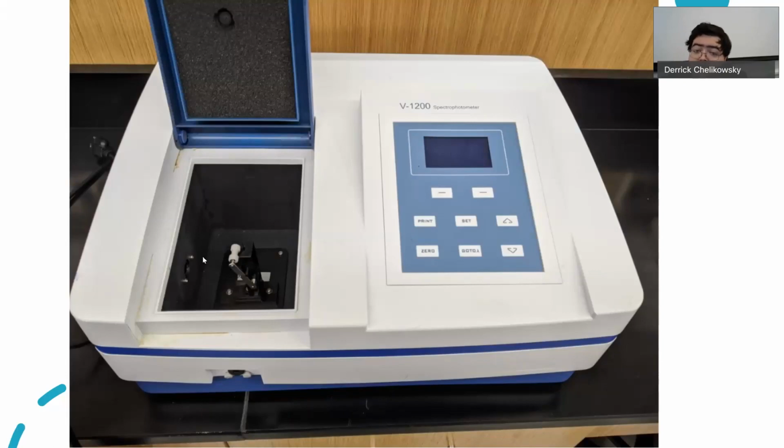Now, right here is where you put your cuvette. This area, which can be difficult to see, is your emitter. And then on the other side here is your receiver. The light passes through here, through your sample, and is measured to the other end.